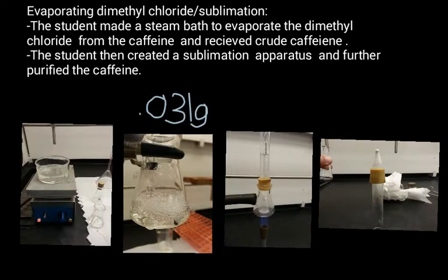The crude caffeine was then put in a sublimation apparatus to further purify. The apparatus consisted of a vacuumed flask, a Bunsen burner, and ice to lower the temperature. The flask was then vacuumed to lower the pressure inside the caffeine, which lowered the boiling point. The ice also lowered the boiling point, allowing the caffeine to further sublime in the apparatus.